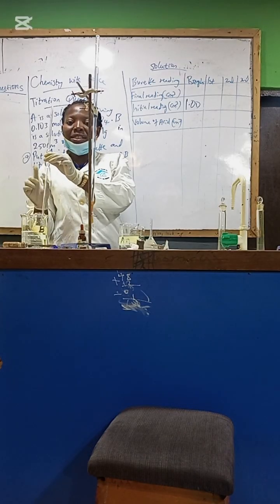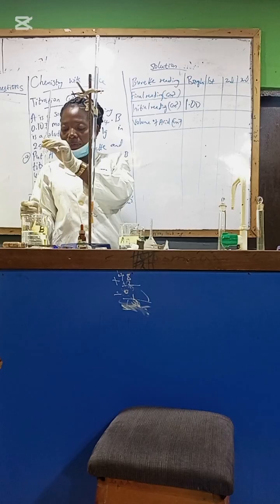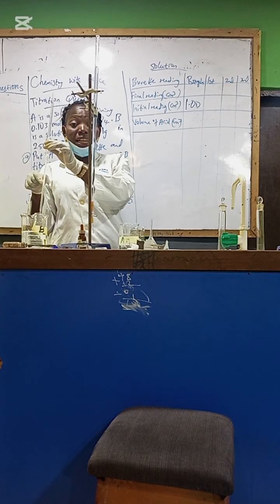We are using 25 ml pipette. Don't shake the last drop.